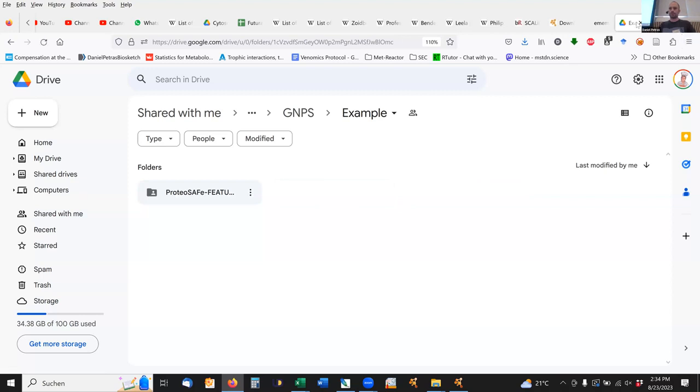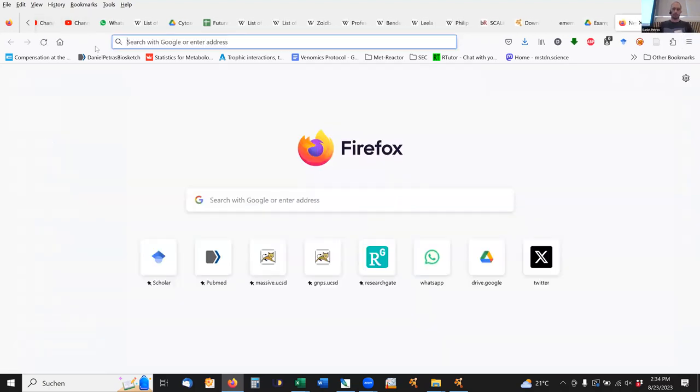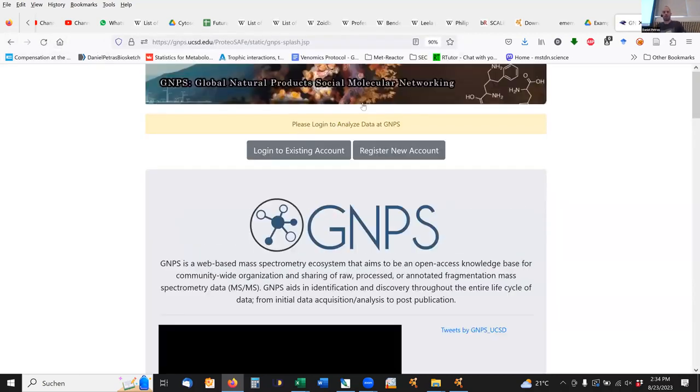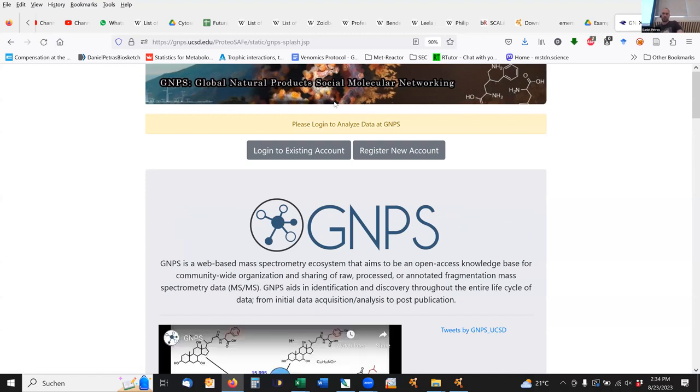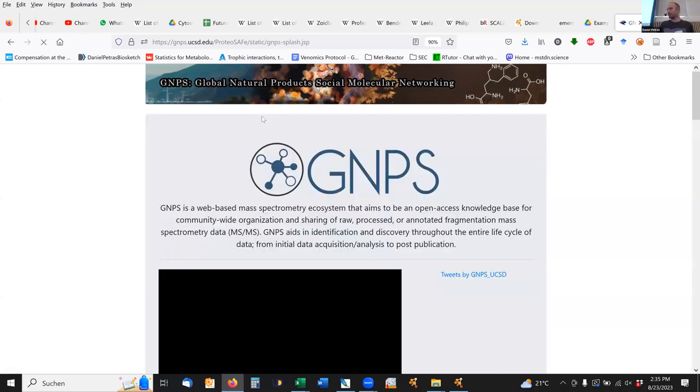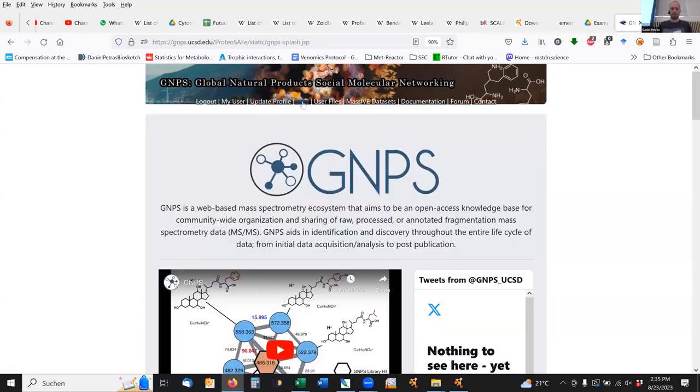Yeah, good question. I'm going to show you quickly. Unfortunately, I don't have that link open on my computer, but I can show it as an example from the latest job I ran. There should be a button, Download Cytoscape Data. It's actually pretty straightforward.